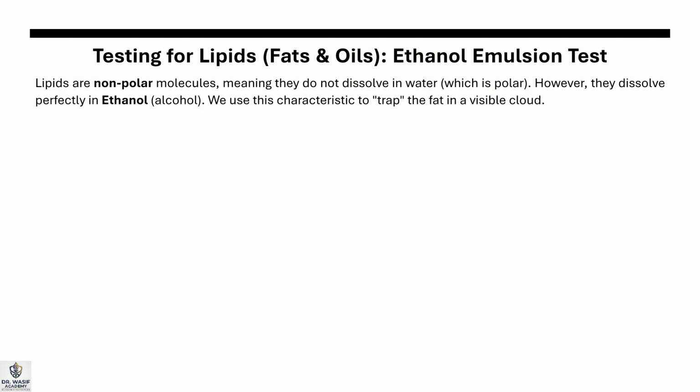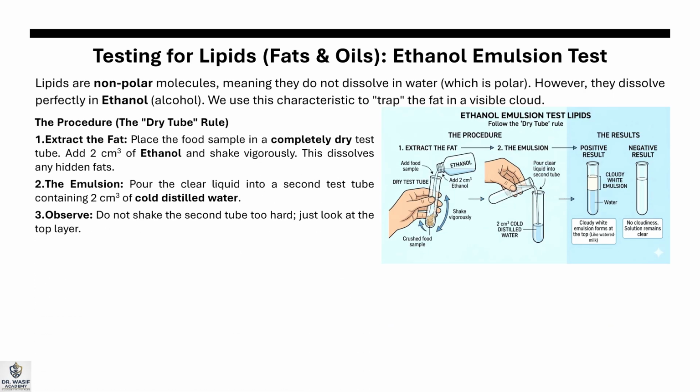So, no doubt that lipids are water-fearing and would not dissolve in it. They dissolve perfectly in ethanol. Means lipids dissolve in ethanol. So we use this property to trap the fat and force it to show itself. There is one golden rule for this experiment, that is the dry tube rule.